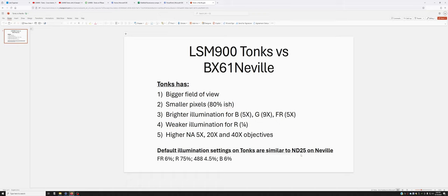I've tried this. If you take an image under these conditions with the ND25 on Neville of the exact same sample in the exact same place with similar exposures and the same or similar objectives, you get an image of similar quality.